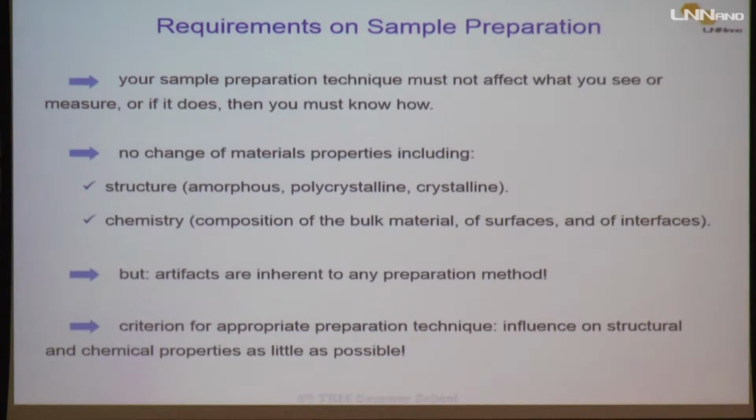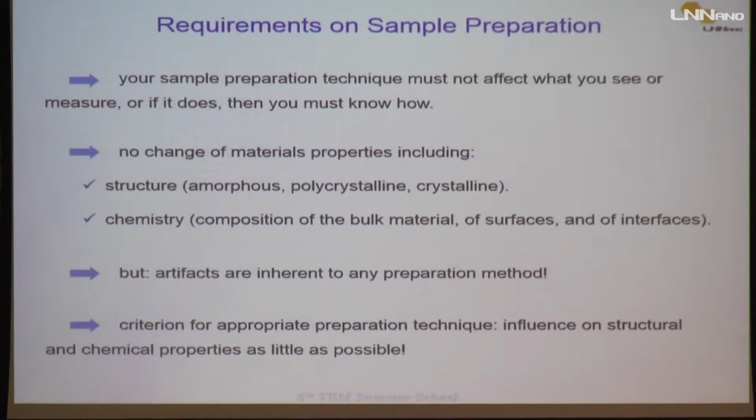Here we discuss some requirements on your own sample preparation. Your sample preparation technique must not affect what you see or measure, or if it does, then you must know how. In all sample preparation techniques, you need to cut your material, crush it, and make it thin.